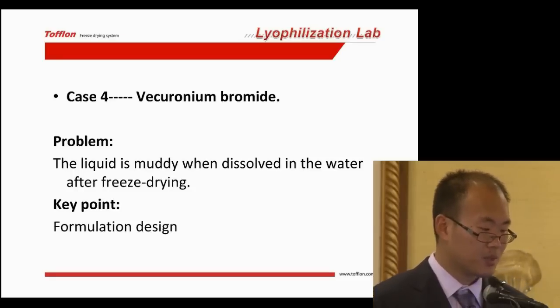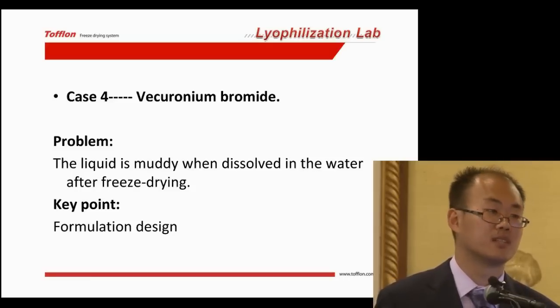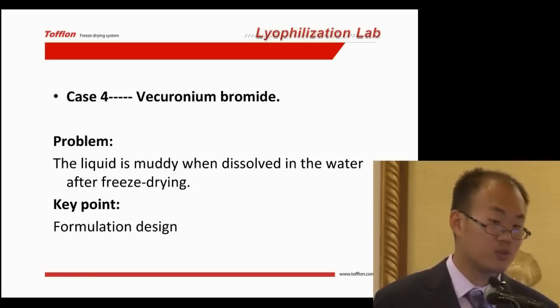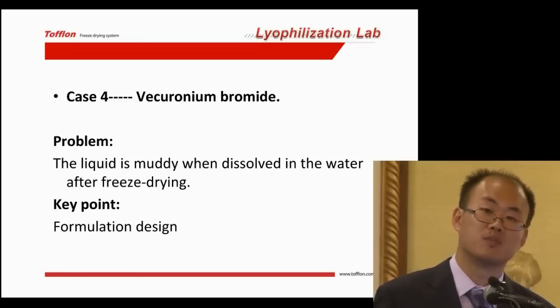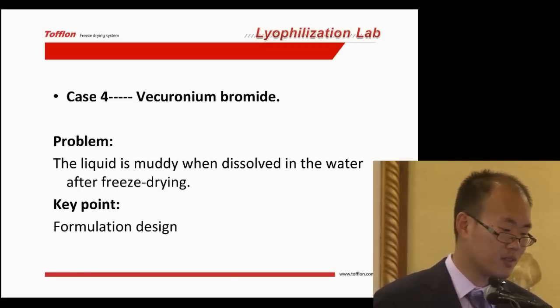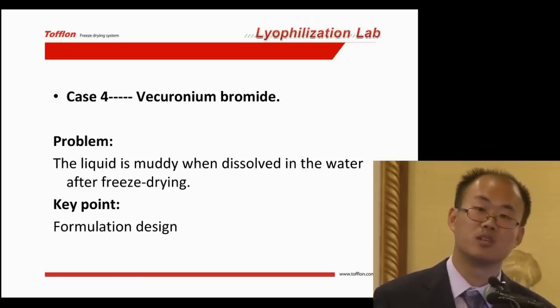It can, because through slow cooling, all the products on the plate could abstract the heat slowly. So the difference between the different points of the plate may be reduced to the smallest value. So we can control the temperature difference through slow cooling.